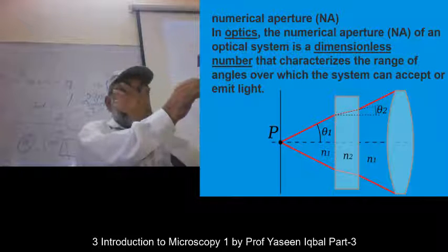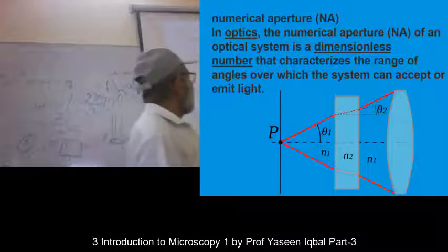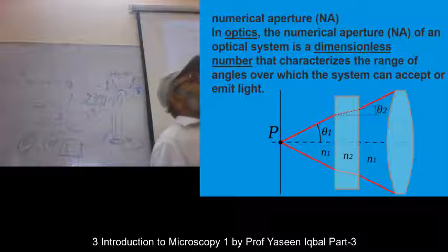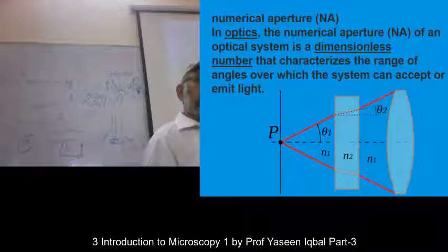So if these angles are coming in the next, here, this is one medium. One medium, for example, air. Right? The ordinary atmosphere. The light is going straight. But there the medium changes. When the medium changes, the radiation diffracts, refracts, bends, or something happens to it.